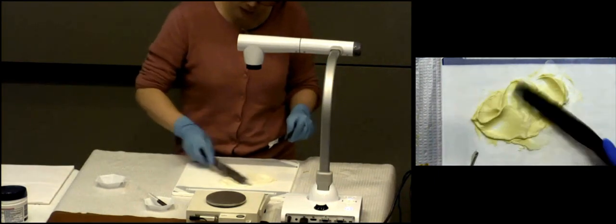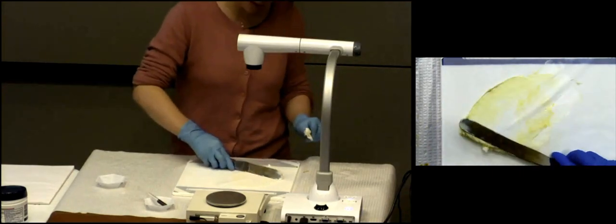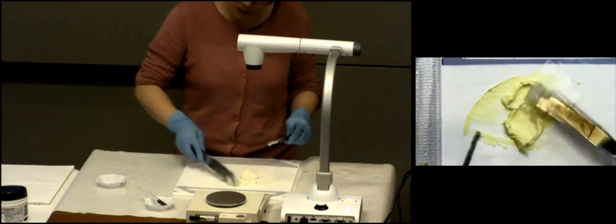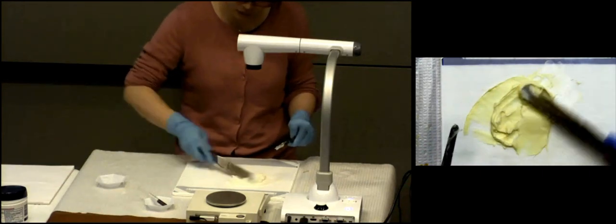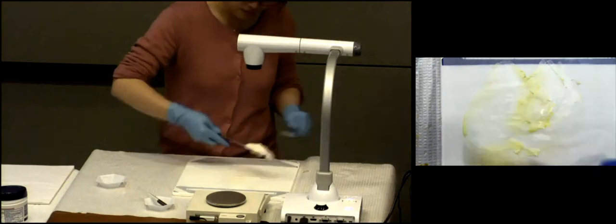All right, the more base I have now, the area on the parchment paper I'm using is clearly increasing. But I'm not really using the whole piece of paper, as you can see. I'm trying to stay as local as possible. Make a big glob here real quick.